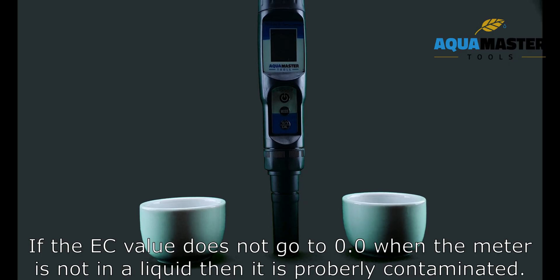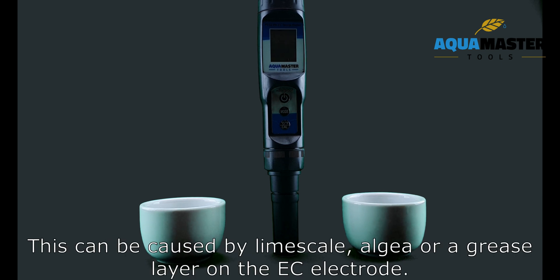If the EC value does not go to 0.0 when the meter is not in any liquid, then it is probably contaminated. This can be caused by lime scale, algae, or grease on the electrode.